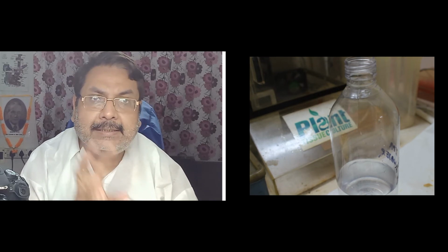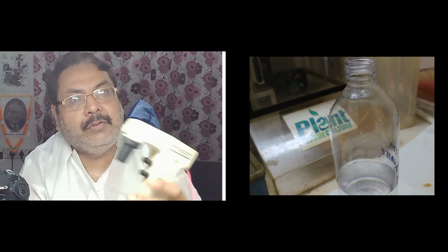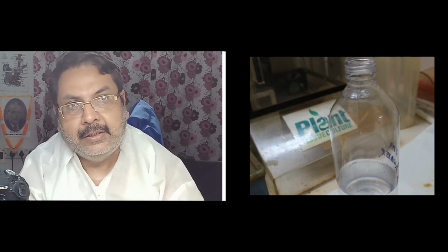This is a pipette controller. This is also a fully powered auto pipette. This is a battery powered auto pipette. It is also an auto pipette, but you cannot fix the volume. It is battery powered, same like the rubber pump which we are using, but it is a controllable rubber pump. With these 2 switches you can control it, because there is a motor inside, a pump inside. So this pump actually pushes the liquid.